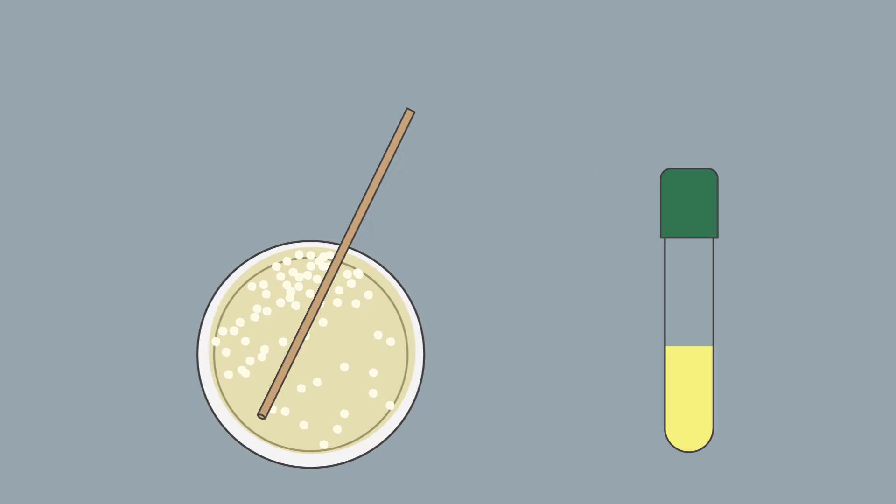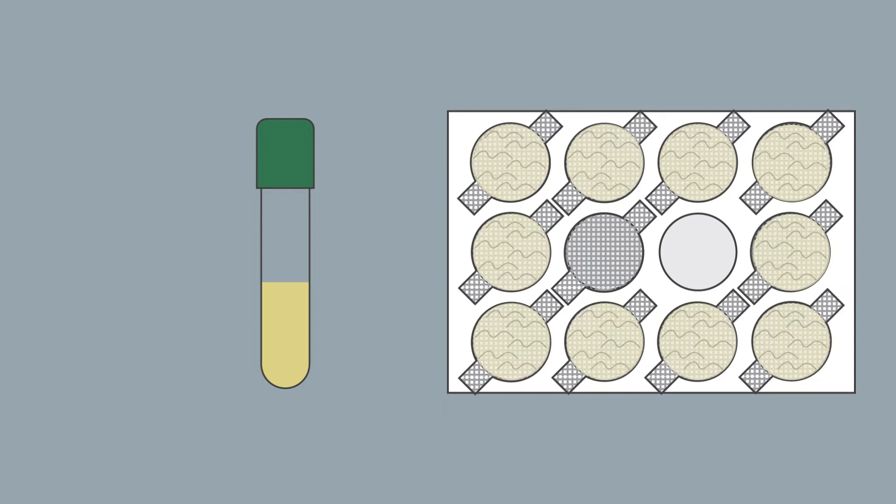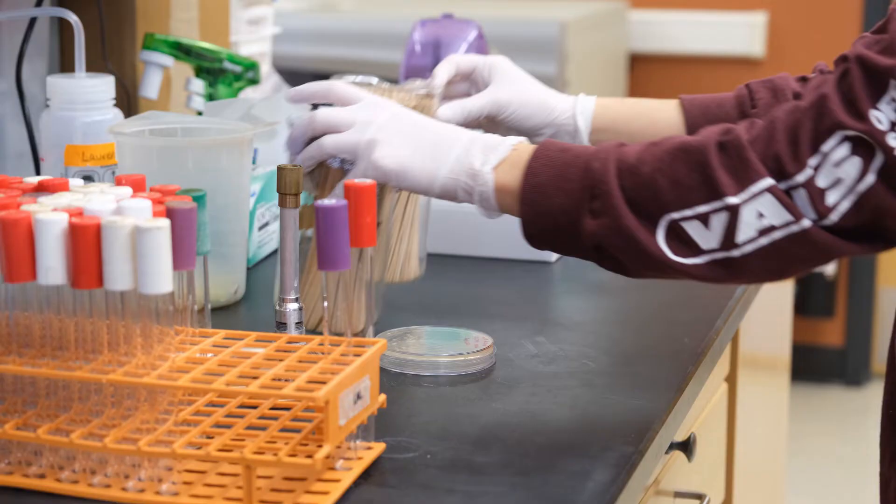So briefly, we're going to start some LB cultures of bacillus subtilis. Once those have grown up a bit, we'll use them to inoculate 12-well plates prepared with MSGG medium, which is a minimal medium, and a mesh insert. The mesh allows you to pick up the biofilm for sampling once it's grown. And then at the end of the video, we'll set up our biofilms to start growing.